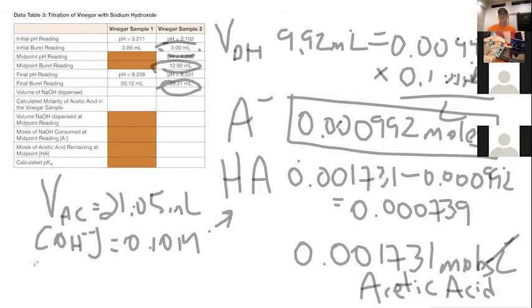So you can see that it's a little less than half. I have a little more acetate than acetic acid. And the reason for that is this isn't exactly midway. That's an estimate of what midway is. When you're doing the titration, you don't know exactly where the midway point is, because basically your final reading is only an estimate of the actual end point.